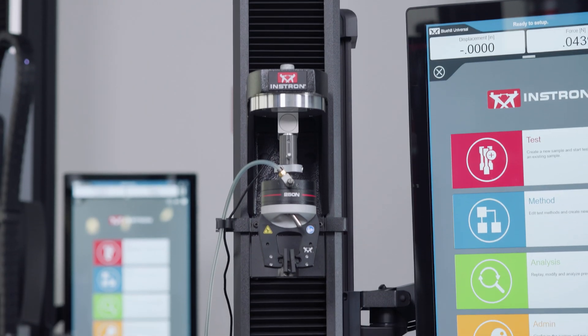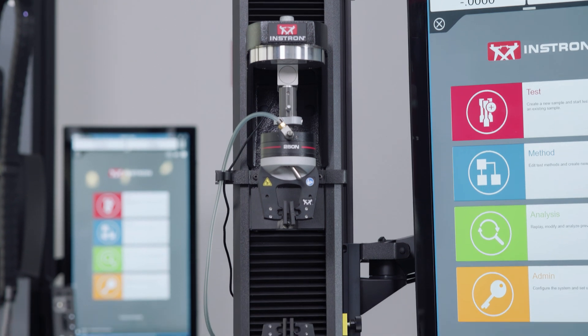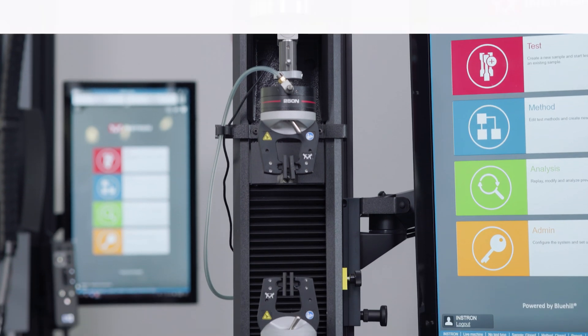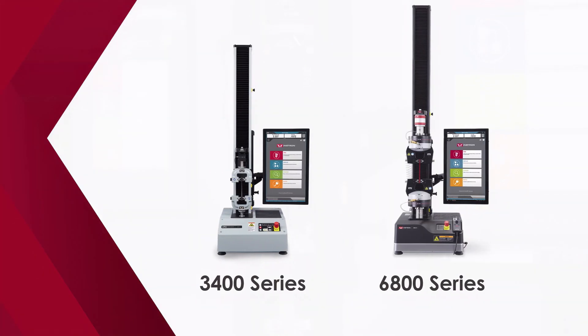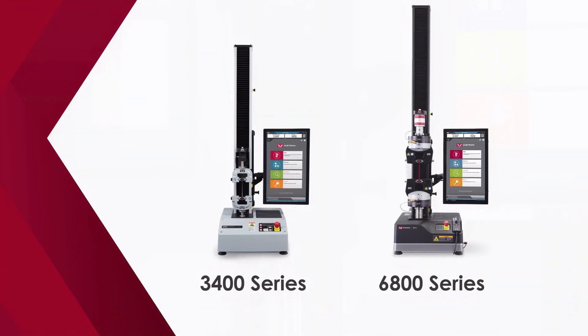This test is performed on a universal testing system such as Instron's 3400 and 6800 series.